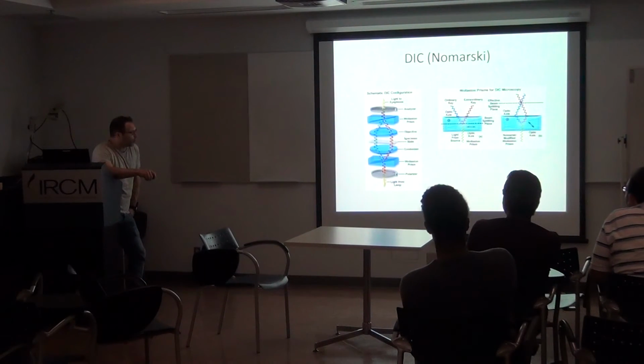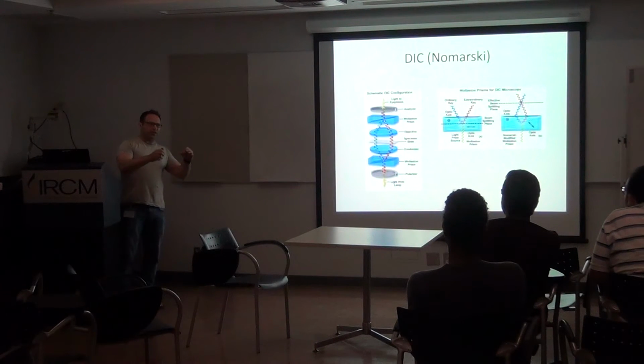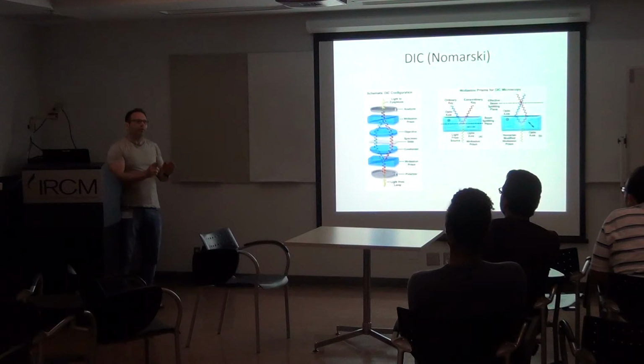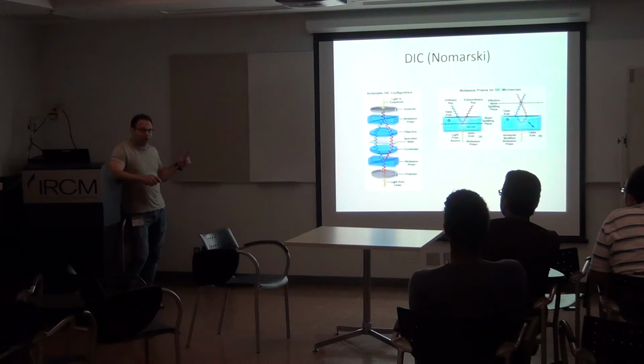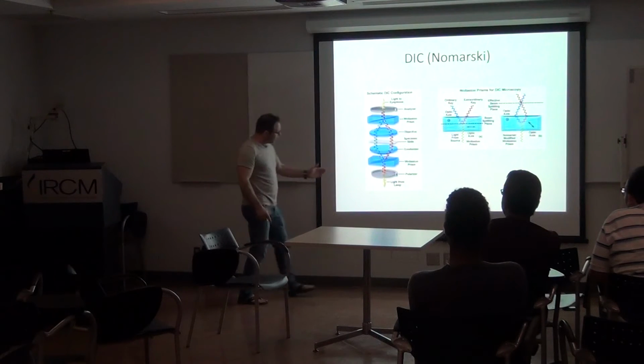So basically how it works, those prisms will, you remember I said if you look through calcite, you will see two images of one thing, because it splits light into two different paths. So Nomarski figured out that he could split light into really, really small, different light paths.